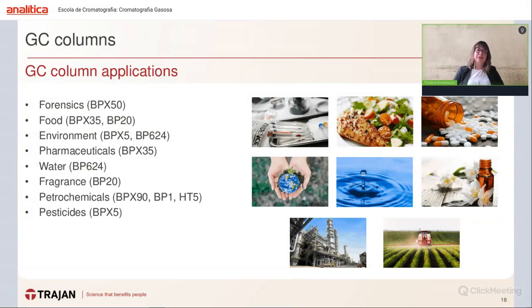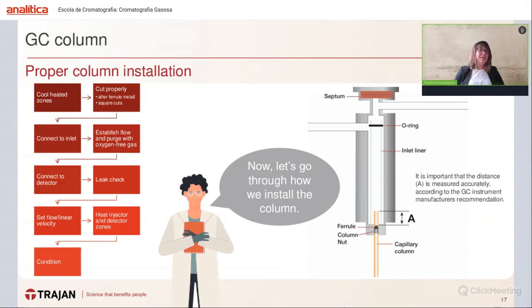We also have a table where we recommend columns for specific applications required by the accreditation bodies, and accredited methods are also listed there with column recommendations.